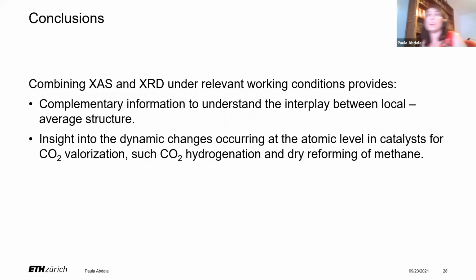So I hope I have shown you how XAS and XRD combined in the same setup can provide complementary information about the interplay between the local and average structure, and that these techniques are rather useful for understanding the atomic scale structure, in this case for CO2 valorization reactions.